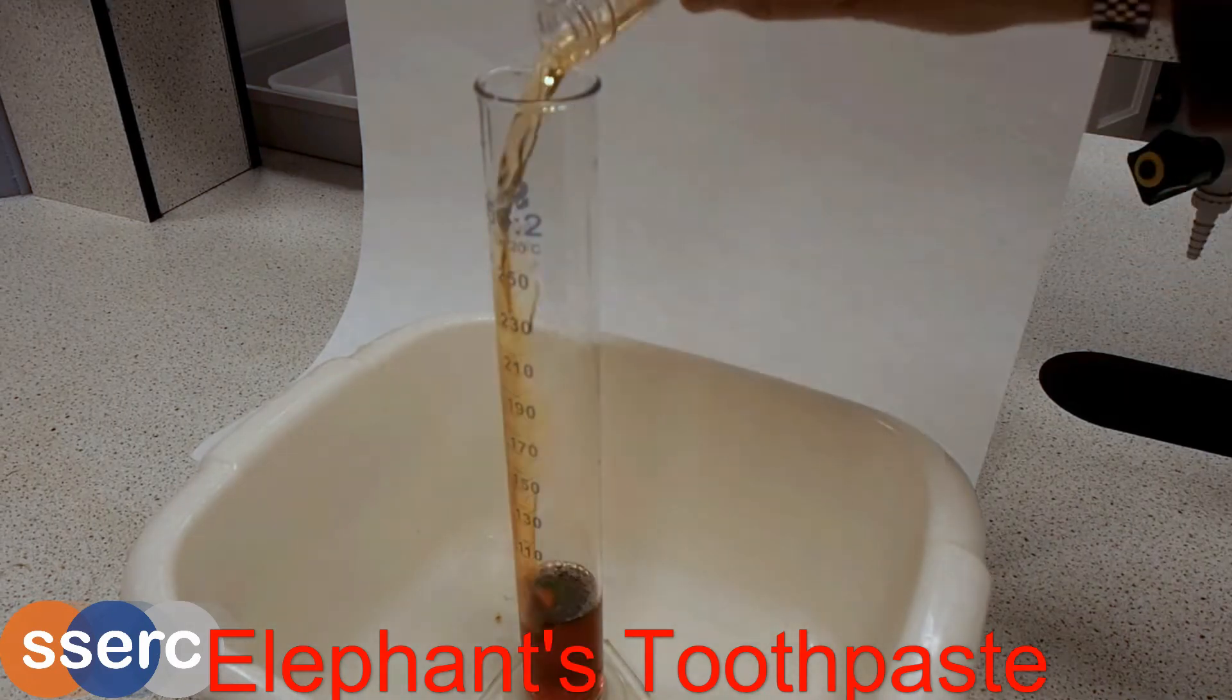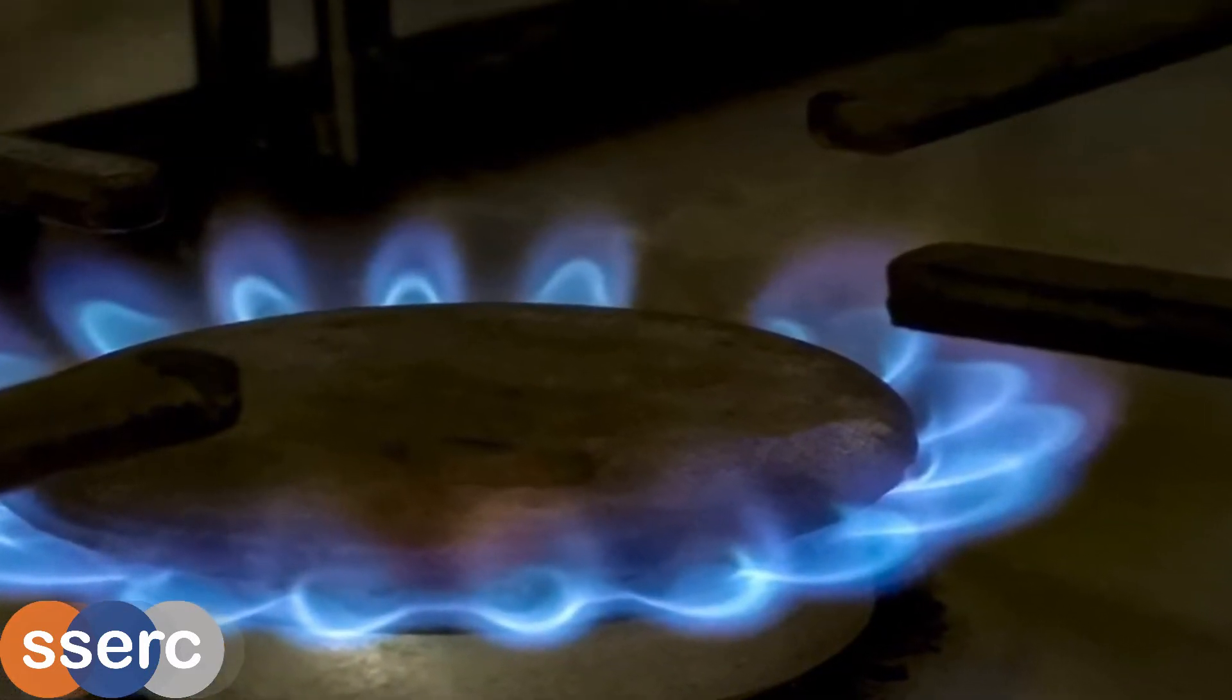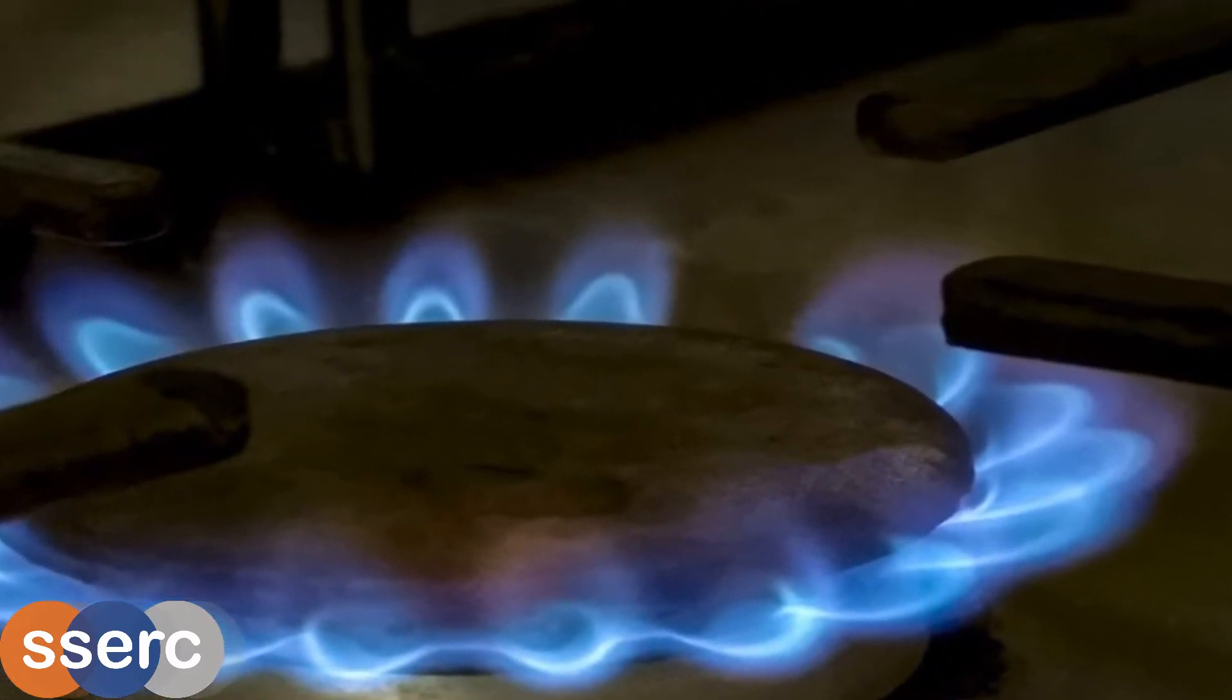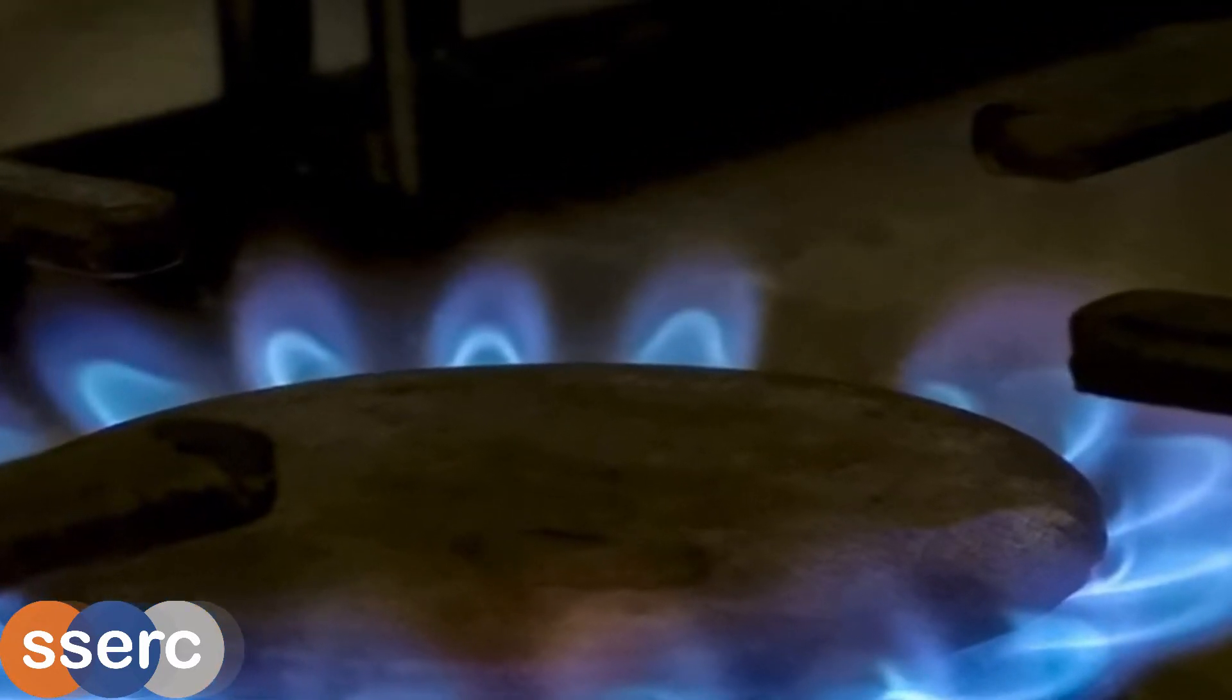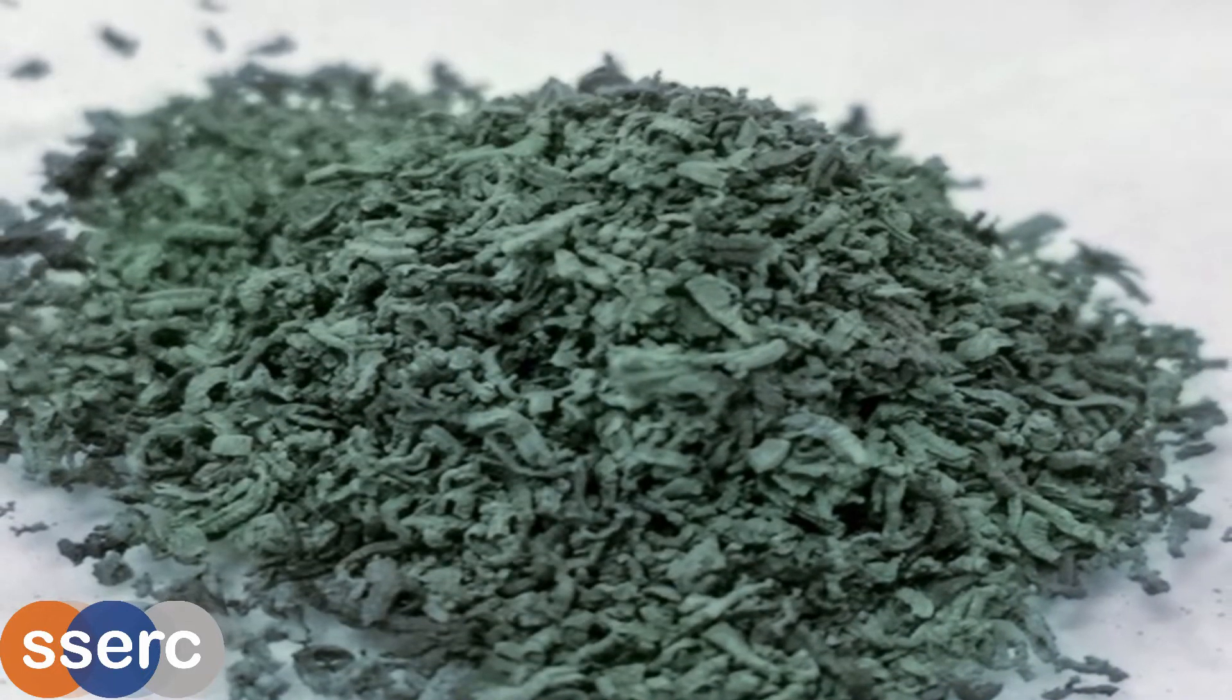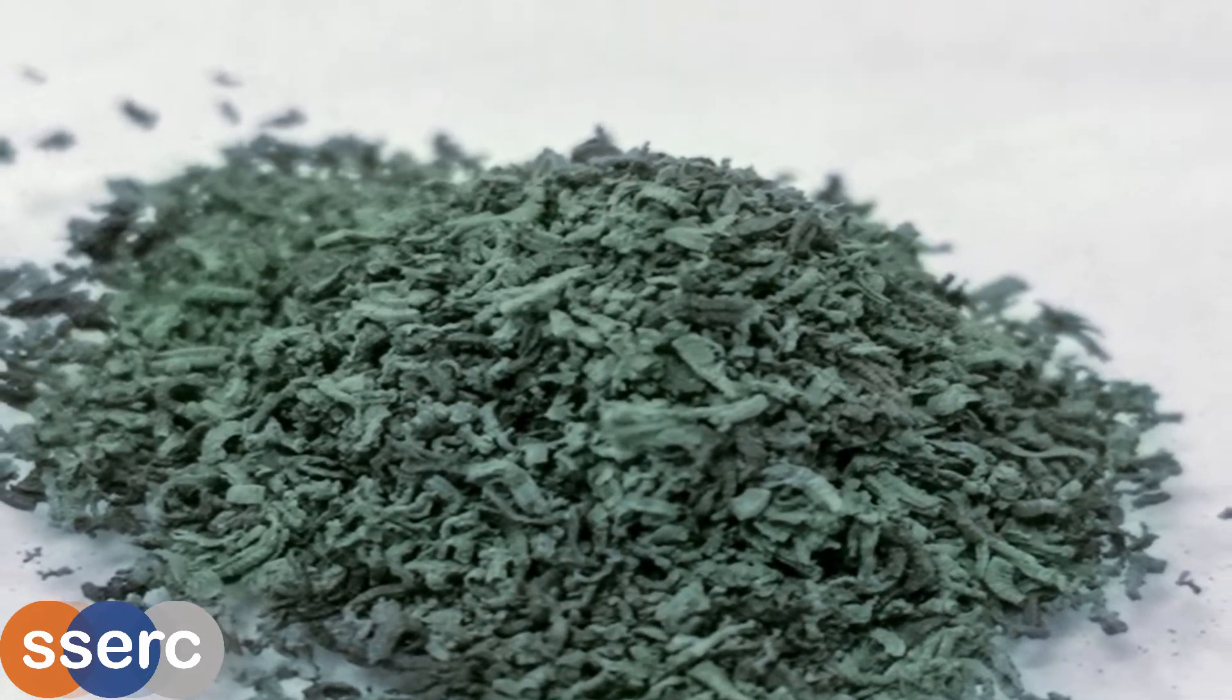There are many reactions that can be used to demonstrate the action of catalysts. This particular one is a little unusual in that it visualizes the catalysis of a reaction between gases. It uses chromium oxide to catalyze the oxidation of ammonia to nitric oxide, producing heat and a striking display of sparks.